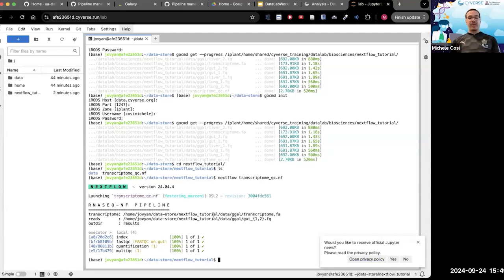This is valid for the other 3 processes as well. Notice how they were like 0 of 1, and they were just waiting. Oh, 1 of 1, I can go next. So if you would have a larger Nextflow, you could be 58 of 62, and then that output goes into another channel, and the other channel has 16 of 20. So can you press cancel, please?